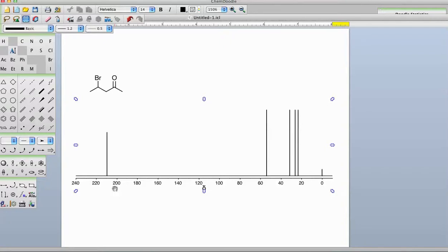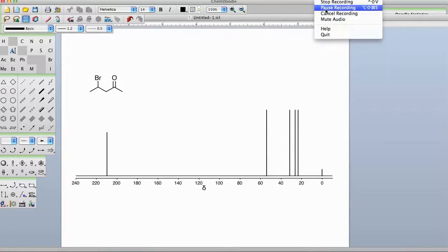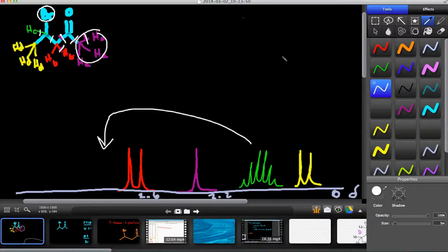To me, the utility of carbon NMR for simple molecules is validating what you think it is. We can get everything we need from the proton NMR, IR, and mass spec. Excuse me. So now that we feel good about our predictions, let's actually look and see if we can find some experimental spectra.